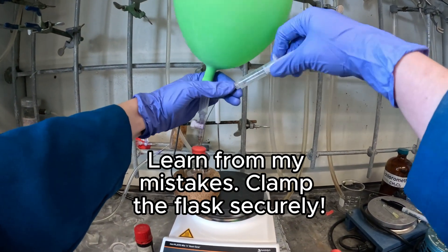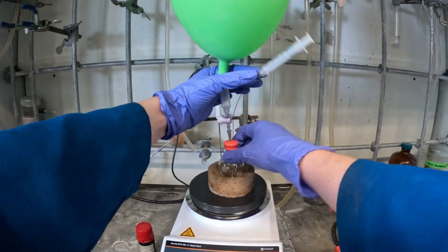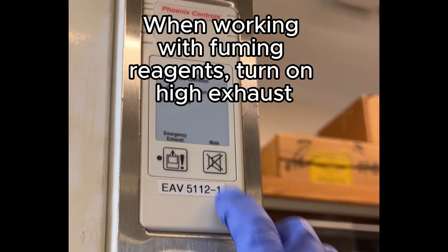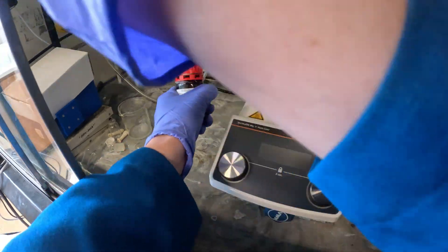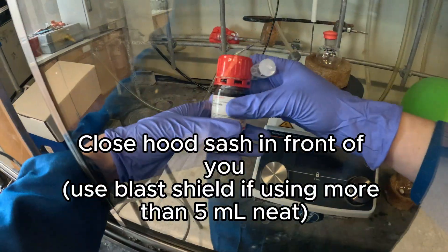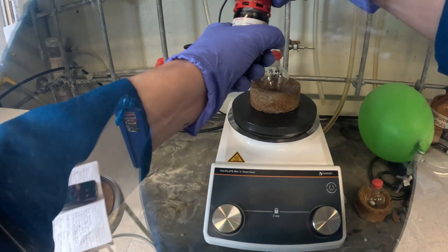Please learn from my mistakes and clamp the flask down so it doesn't drop and fall over and break. When you're working with fuming reagents, turn on the high exhaust, especially do this in the hood. If you're using more than 5 mils, you should use a blast shield.